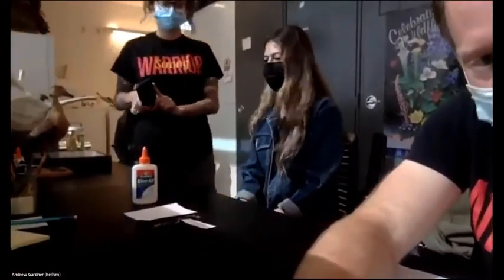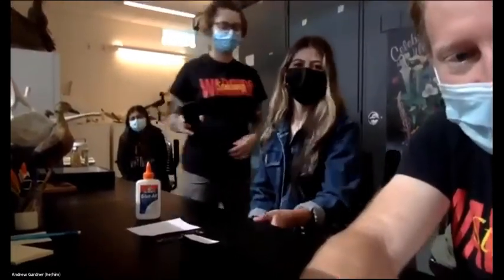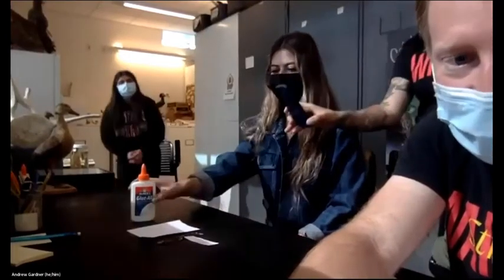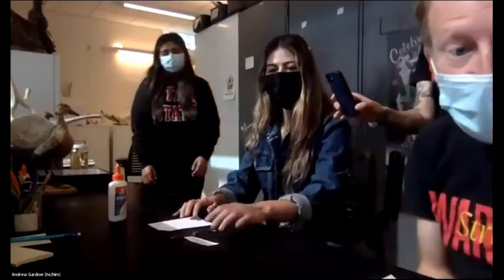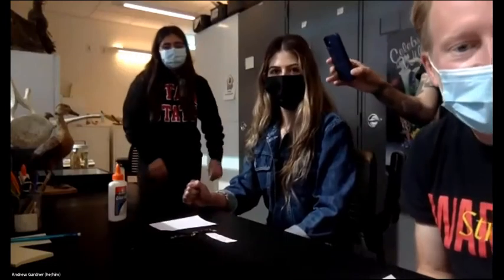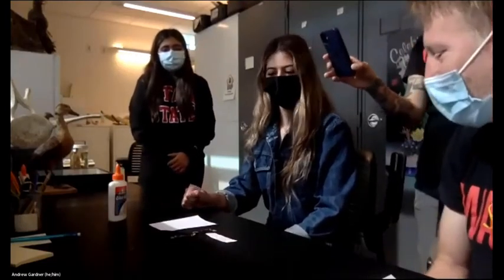Awesome. Okay, well, what we're gonna do is just explain how to make a plant specimen using glue. Something many of you probably think you've got some experience with, which you probably do. Here we go. I guess we can show you the key steps, which are not too complicated. Our primary suggestion is to use less glue than you think you might need, because then it'll dry faster and it'll be less messy, which we all appreciate. So take it away, Laura.